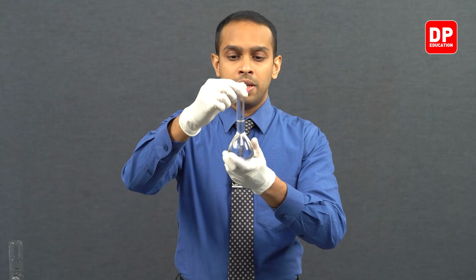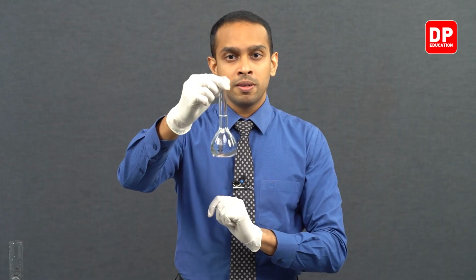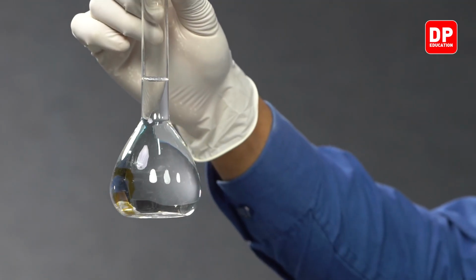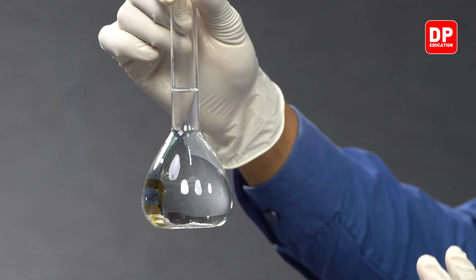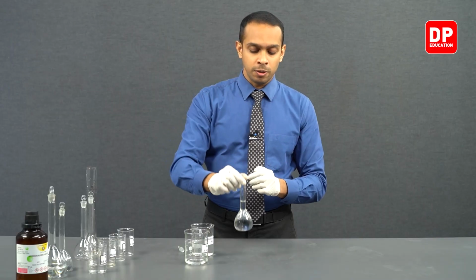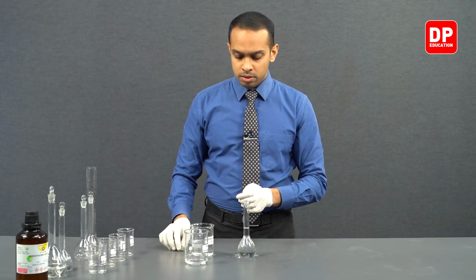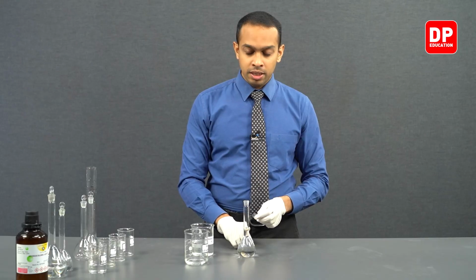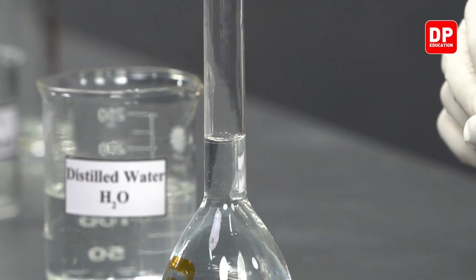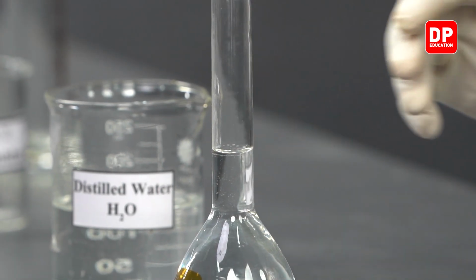Now everyone, we have produced another solution of HCl which has exactly 0.6 moles per decimeter cubed concentration of HCl. We can see the calibrated mark and the meniscus aligns perfectly with the calibrated mark.